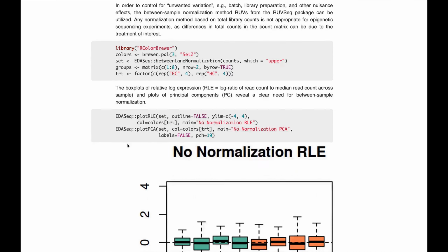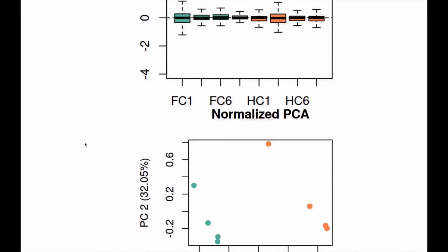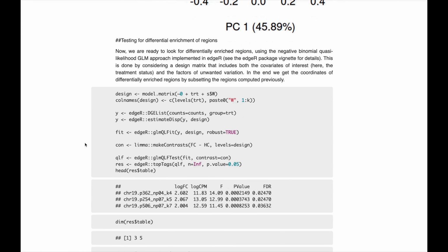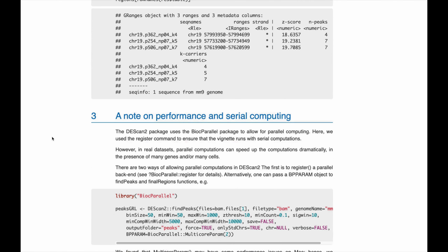And then you can do nice figures, normalizations, PCA plots, which you can do anyway. And this part is a direct quote out of edgeR, more or less, with some modifications, but even without, it would work as well. I must admit it took me some time to figure out how to use this package with the real data.